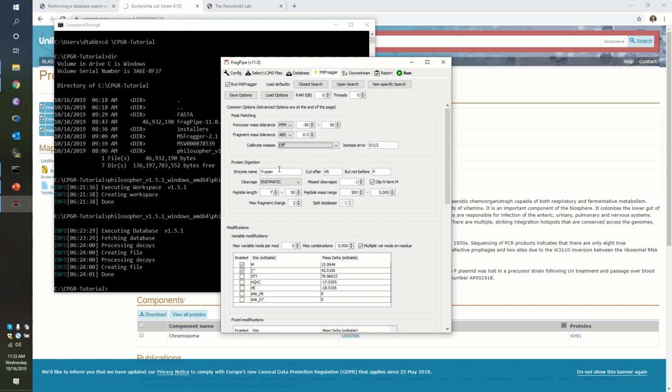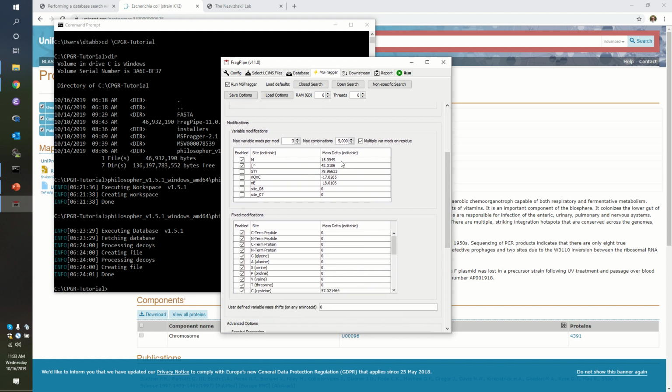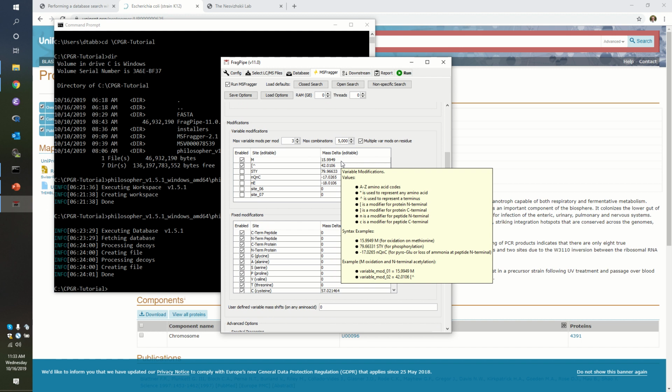Okay, we note that we specify what kind of enzyme is being used. Those defaults are all correct. In most cases, the set of modifications is reasonable. Why would we look for a plus 16 on methionine? It's the top line of modifications there. Why would we look for methionine to gain 16 mass units? Water is 18, so we're not hydrating the methionines. What's 16?